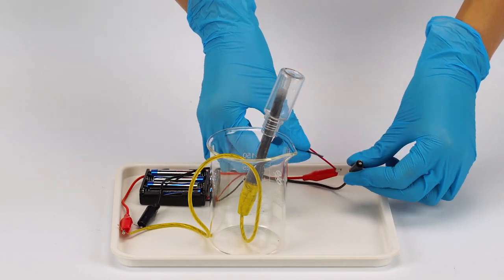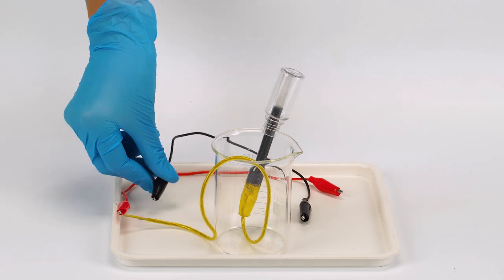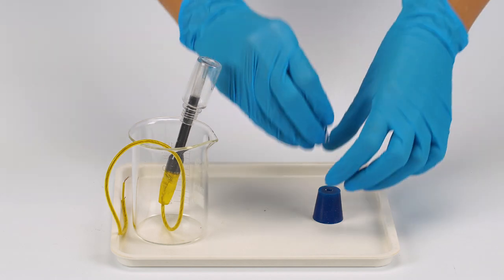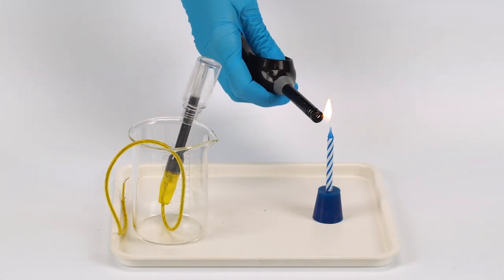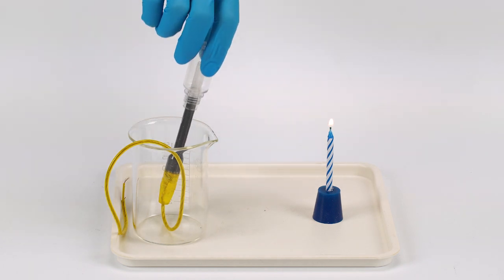Disconnect the crocodile clips from the battery holder. Now try to extinguish a candle using the reaction between hydrogen and oxygen. Put a candle in the rubber stopper with one hole. Light the candle. Take the bottle off the pipette and carefully bring it close to the candle flame.